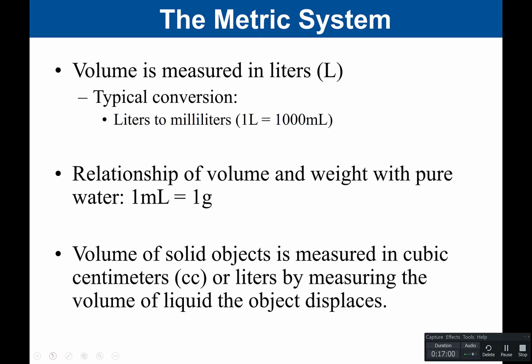Volume of solid objects is measured in cubic centimeters, so cc's, or liters, by measuring the volume of liquid that the object displaces. So for this part of the experiment, you're not just measuring height. Now we're going to measure volume, and we are going to look at both measuring water as well as measuring the volume of a rubber stopper. And so I have 2 videos to describe this experiment, and then I will go over the data with you.